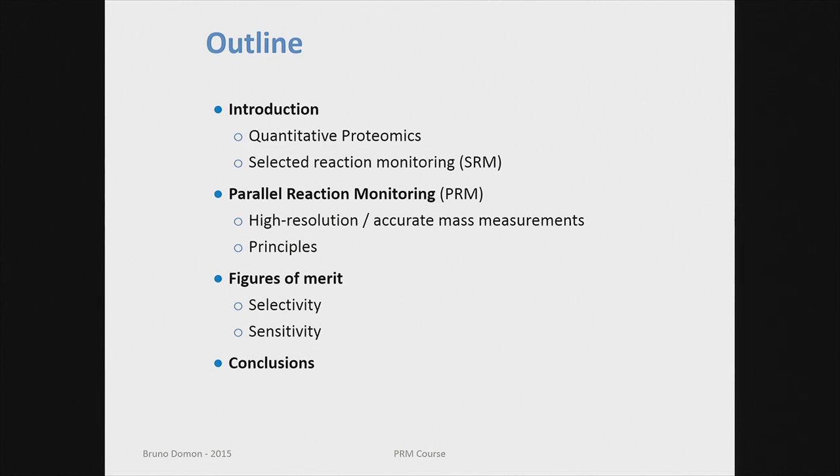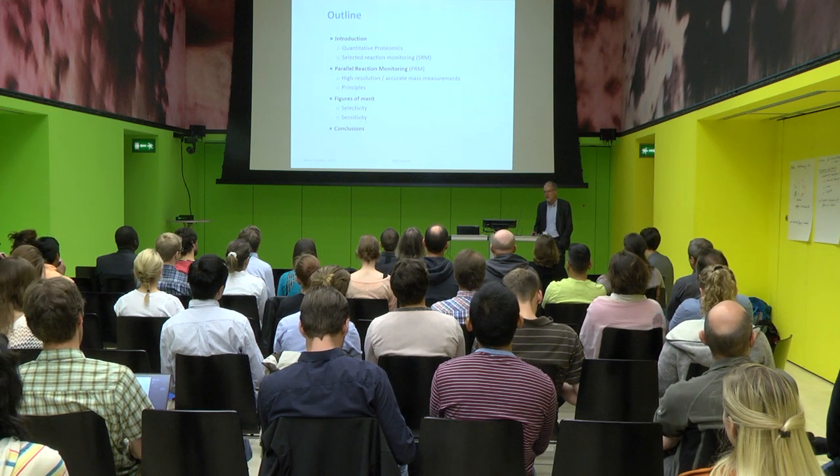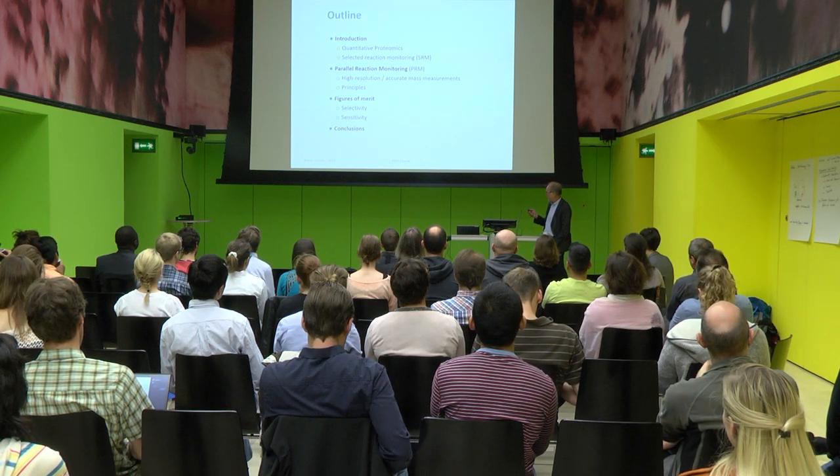But what I'd like to do today is just go through the basics. I know you already have the course for 1.5 days, so maybe some of the first slides are a recap of what you have heard before. But I'm taking a little bit of a historical view and seeing why targeted proteomics has moved from the classical SRM type experiment into high resolution accurate mass.